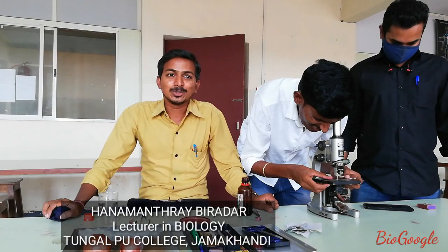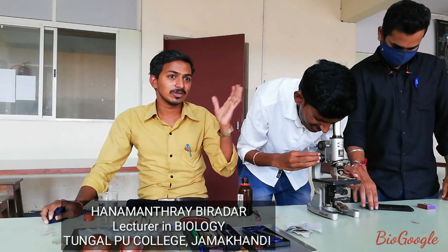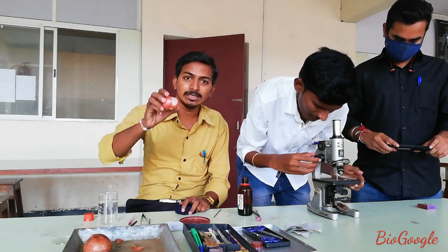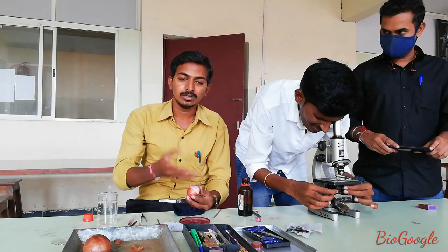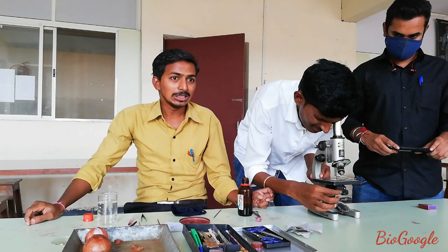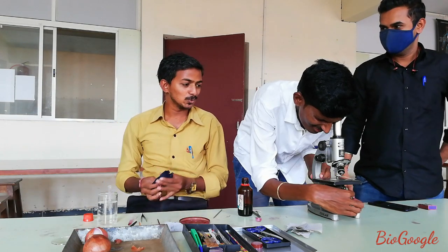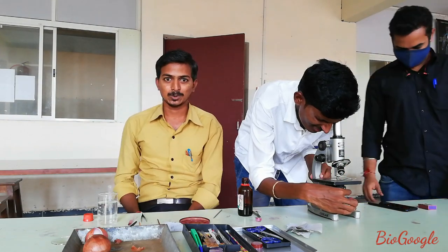Welcome to our community. Today, with the help of Bhavraj sir as well as Krishnan sir, we are demonstrating the process of nuclear staining by using the onion peel. Krishnan sir is going to demonstrate the process of nuclear staining on the onion peel. We will observe the results with the help of our microscopes.